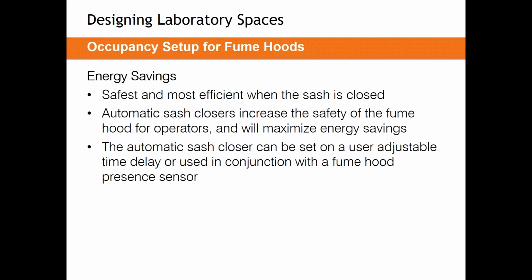I've also heard, on a lighter note, that shaming people works extremely well. Putting up posters and signing sheets about who left fume hoods open. There's a lot of different mechanisms we can use to make people close these fume hoods. It's not just for energy savings. It's for their safety as well, and we need to help them understand that.